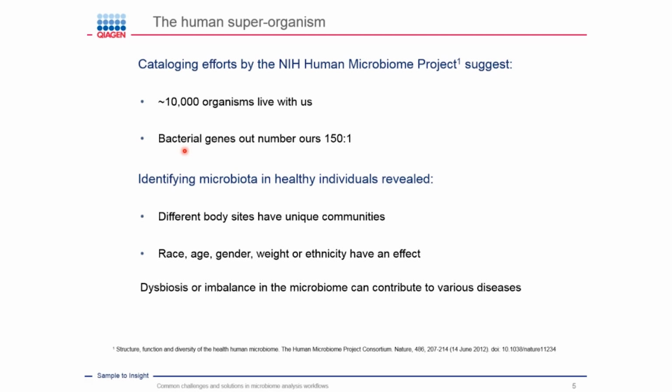So why is it coming up now, and why is it not obvious since years? Before molecular biology technologies were applicable for microbial analysis, you could only use things like culture assays to find bacteria. On the one side, this allows you only to detect and identify bacteria which you can grow. And on the other side, you will just find what you're looking for. For example, selective media for some bacterial strains are not suitable for growing other strains. So this was a very narrow view.